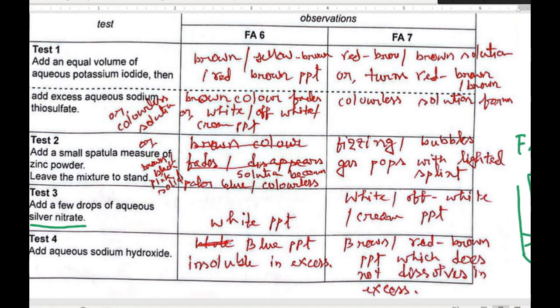So here as it is hydrochloric acid and iron 3 chloride, you can write this also chloride ion test, white precipitate or off white or cream precipitate, because iron 3 in acid has a little bit of color. Exactly white you can't see because iron 3 has some color, so white color is disguised. That's why you can write white or off white or cream precipitate is formed, but you must write precipitate.